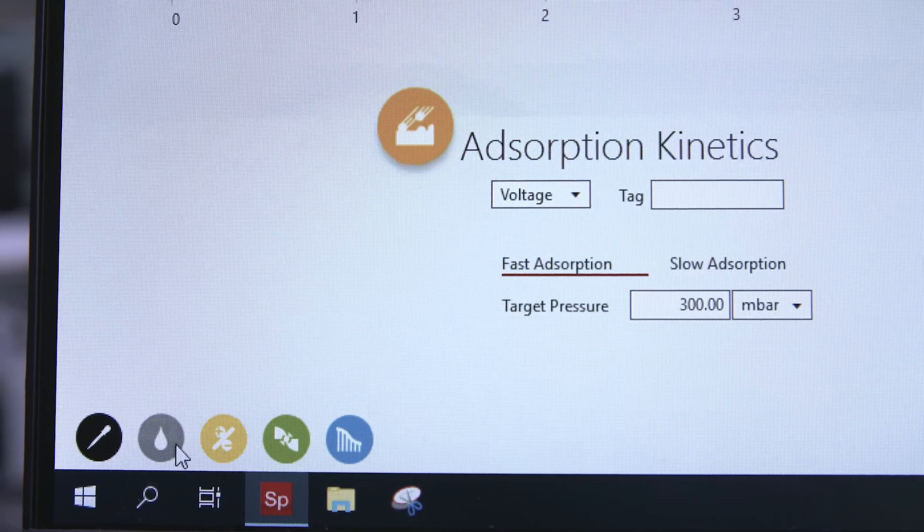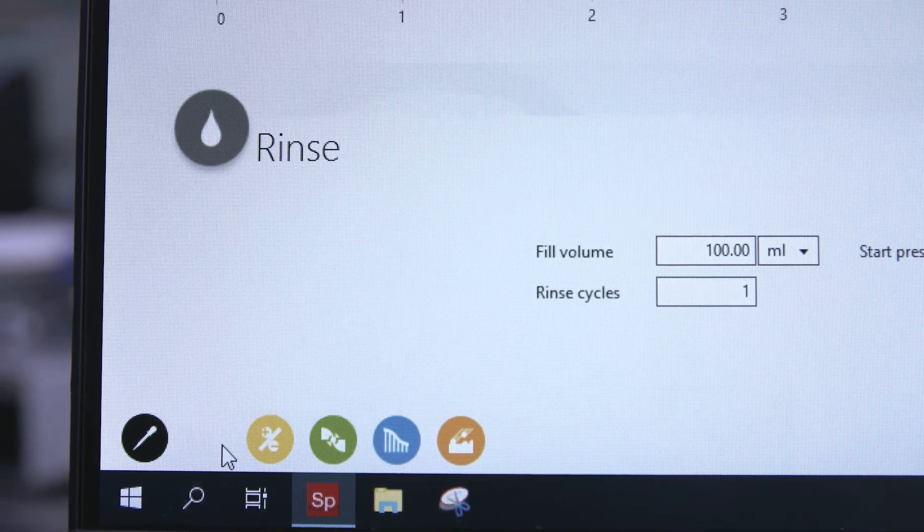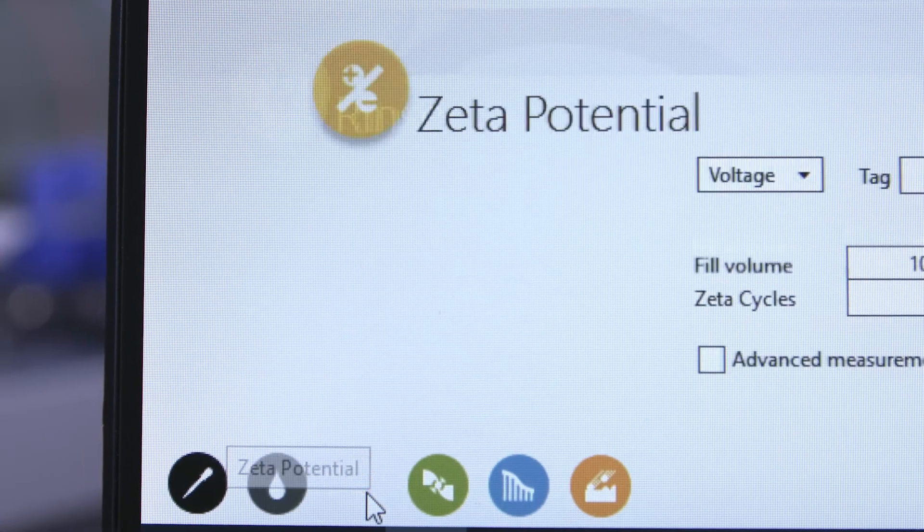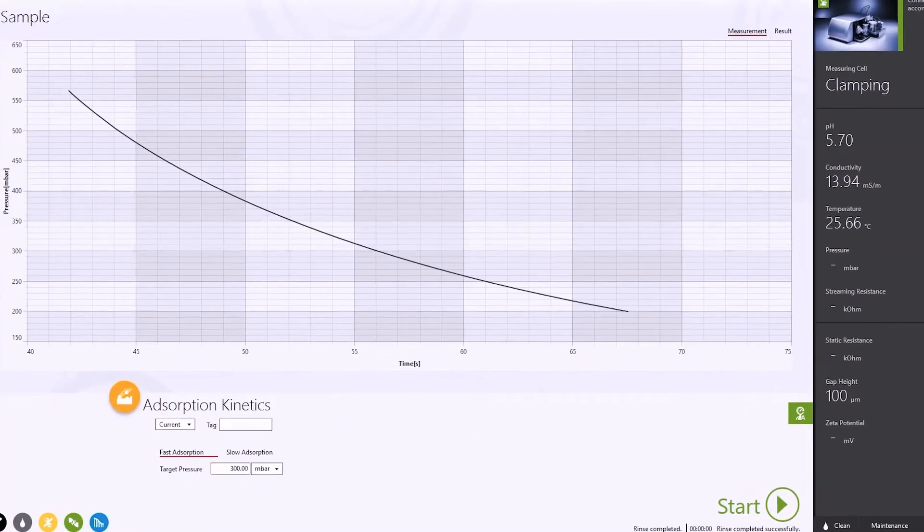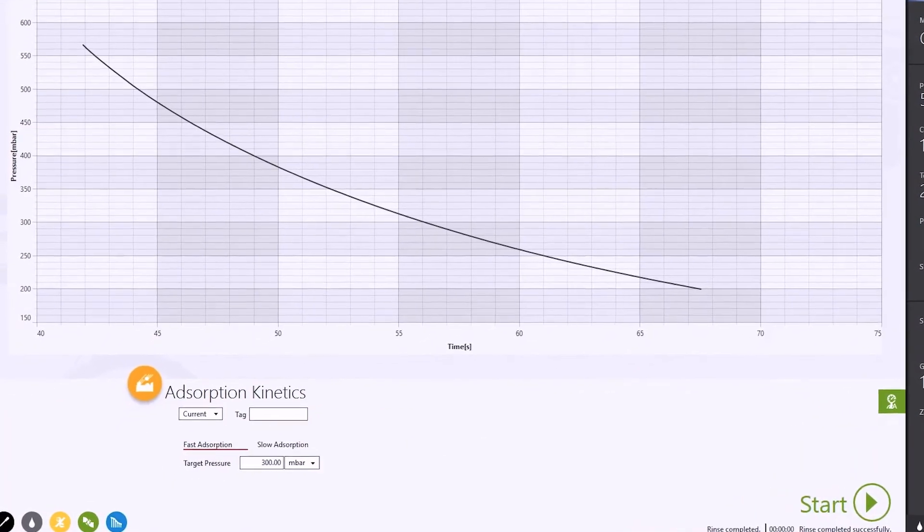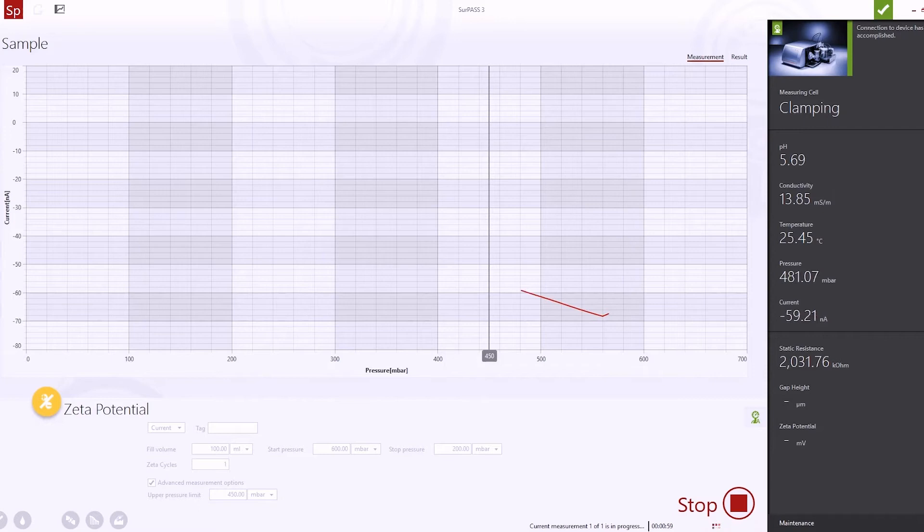The software offers predefined procedures for rinsing, zeta potential analysis, and recording of adsorption kinetics. A single-point zeta potential measurement can be performed in less than two minutes.